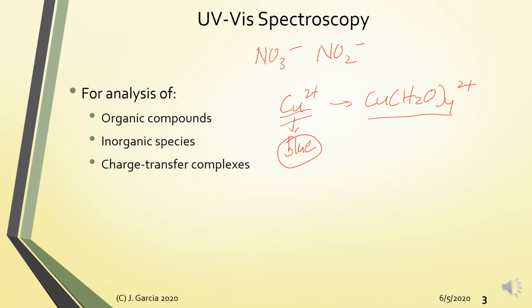All right, so to be able to more sensitively detect iron 3, you can analyze iron 3 based on its reaction with orthophenanthroline. So yung iron phenanthroline complex, 1,10 phenanthroline complex, which is parang reddish orange yung kulay ng complex na yun.